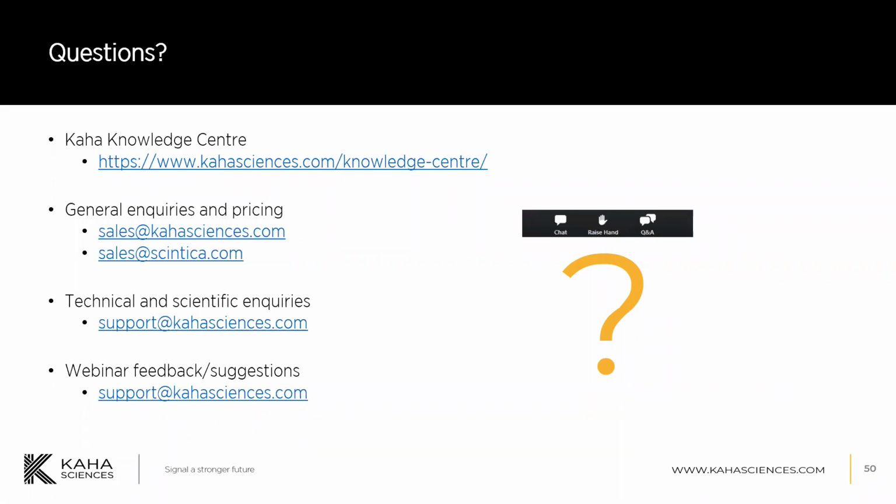Another question was asked about using this system in different stroke studies. Your thoughts? It's certainly possible, and it's very much appropriate to that. I would refer them to Pratik Thacker's paper or search for Fiona McBride stroke and rat stroke, and you'll find some papers, or have a look at the recording of Pratik's webinar and you'll see he presents some really nice data of the tissue oxygen measured in the brain in response to stroke and during the recovery afterwards.